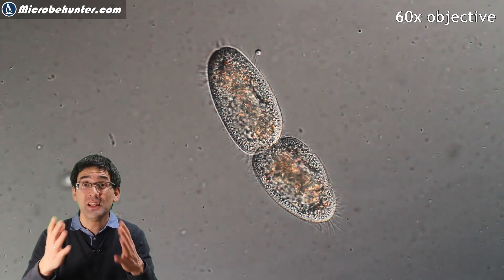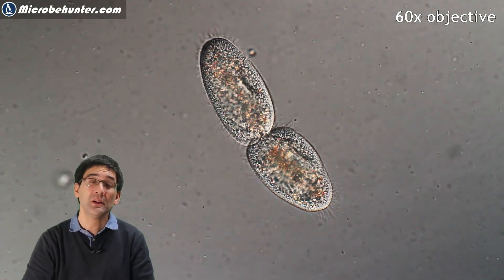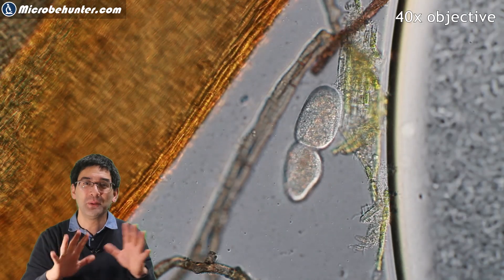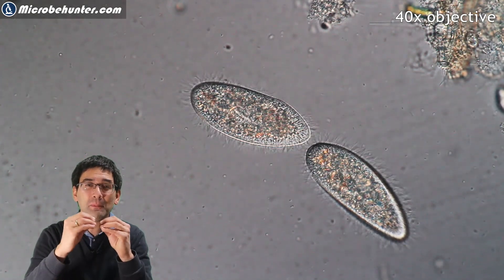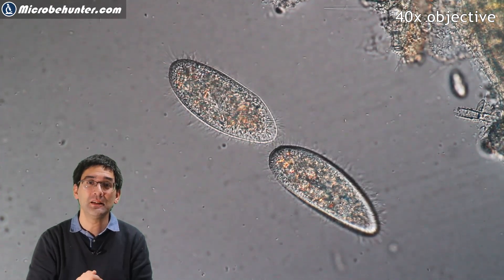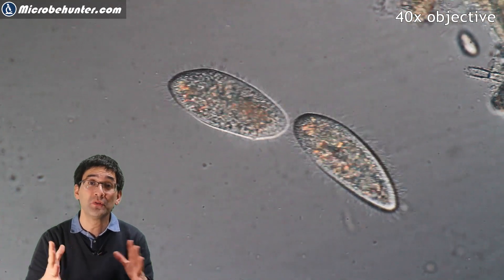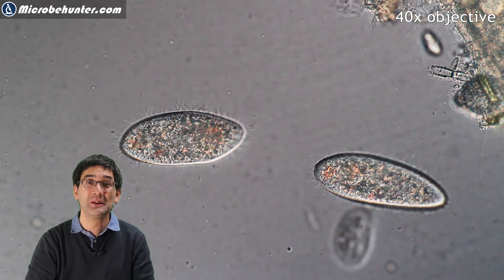The third way you can distinguish them is: if you see a cell starting to divide like this, follow it around and you're going to see two smaller cells forming, and then you can be pretty sure the cell was dividing and not conjugating. Look at the cells in the center — and now it's separated. Did you see that? Sometimes it's a little bit difficult to see the dividing cells when there's so much chaos going on. This paramecium as well is now starting to divide, and after a few minutes — less than 10 minutes — they're only connected barely over their cilia and then they too will separate. The actual division process is quite fast; it only takes a few minutes, and here as well they are now separated.